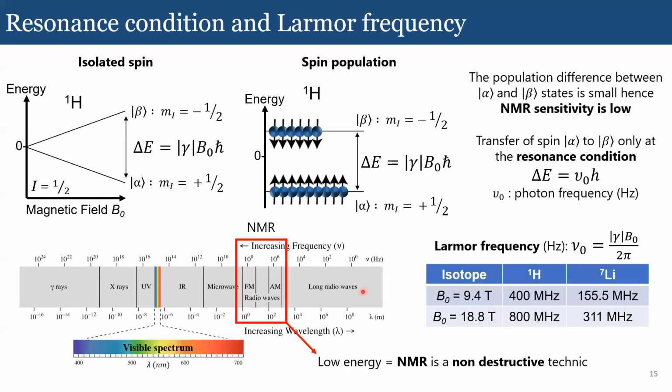One thing I can mention: you know that NMR deals with different nuclei, and the reason that you have to match that resonance condition is the fact that the nuclei have very different frequencies. In NMR, when you're working with proton, you're not going to be bothered by any other signal than signal coming from actual proton. You don't have overlap because the signals are very well separated. So I guess you could say in that case that resolution is really a big plus for NMR. But yeah, just wanted to put that on the side.